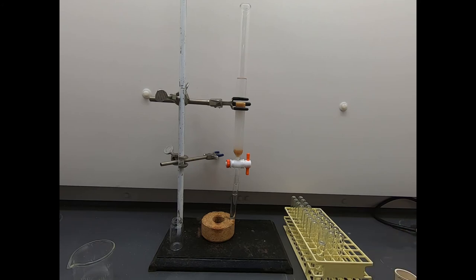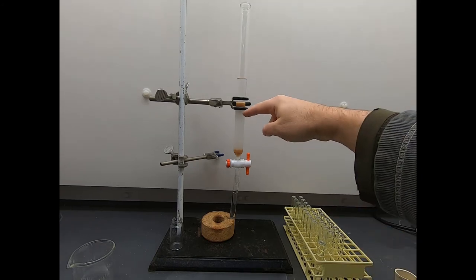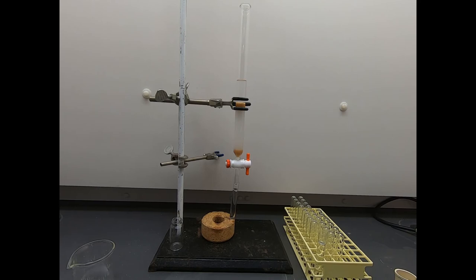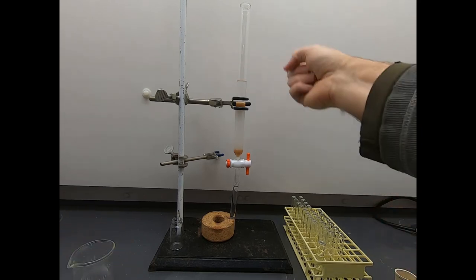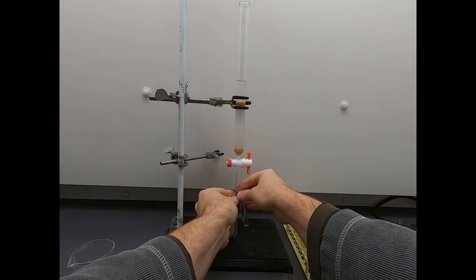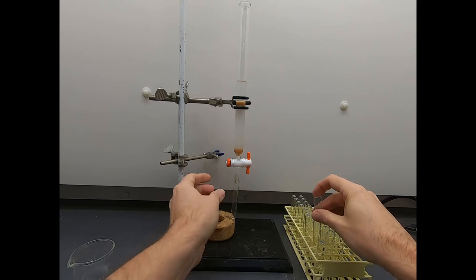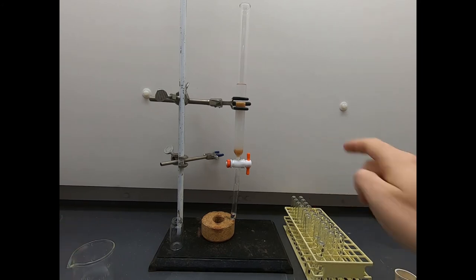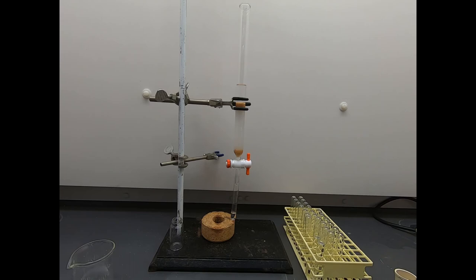There are automated machines that will help this go faster. You can also apply pressure. Right now this is called a gravity column because gravity is pulling the solvent, the mobile phase, through the stationary phase. You can apply more pressure to the top of your column. You can apply air pressure, and that will cause the dripping to go faster, even a lot faster. You have maybe used different types of silica gel, but it's the exact same idea. You have a mobile phase passing through a stationary phase. For these two compounds, there's not a lot to watch because you can't see how they're moving. But we know from the TLC plate that they are moving at different paces on this column. So I'm going to continue adding solvent to the top and collecting the solvent in fractions off the bottom. And eventually we'll take some TLCs and see if our compounds have separated.